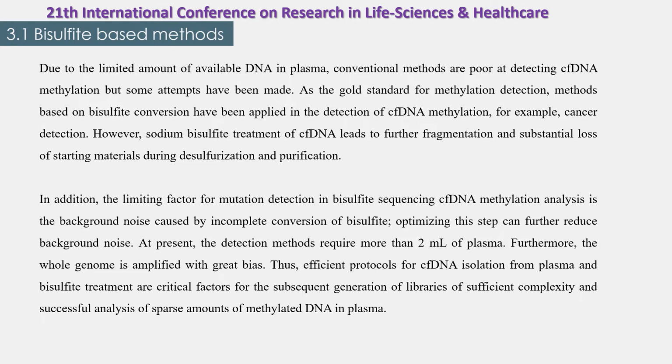In addition, the limiting factor for mutant detection in bisulfite sequencing cell-free DNA methylation analysis is the background noise caused by incomplete conversion of bisulfite. Optimizing this step can further reduce background noise.